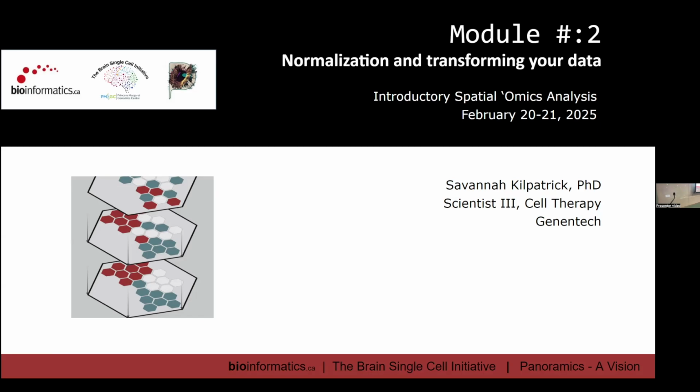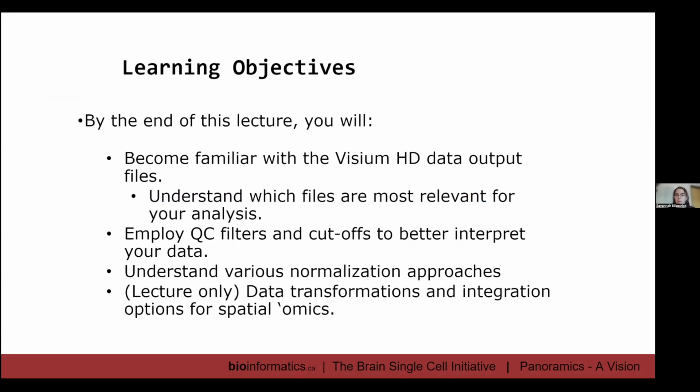And so today, I just want to give a quick overview of some of the different file outputs that you'll be receiving from your Visium HD data sets, some QC that you can perform, as well as different normalization strategies that you can consider. I'll keep this short so that we can move directly into the hands-on portion. But ideally, at the end of the lecture, we feel a bit more comfortable with the data that we'll be working with.